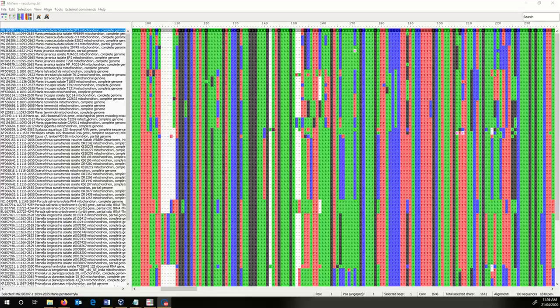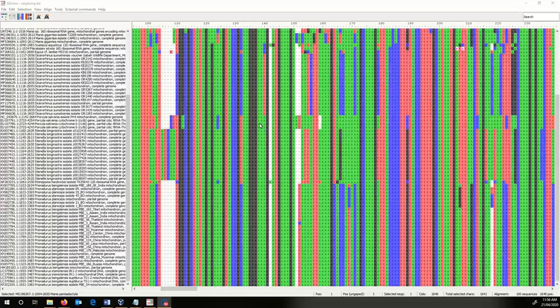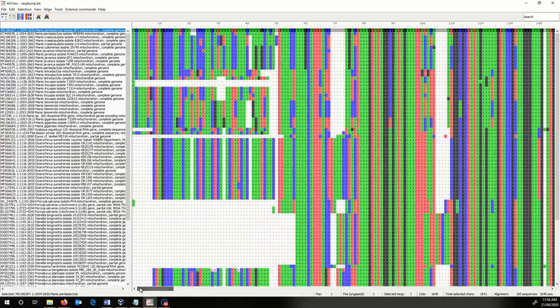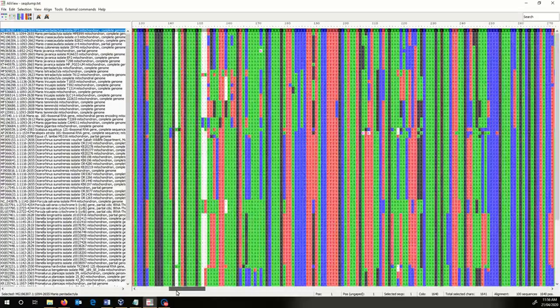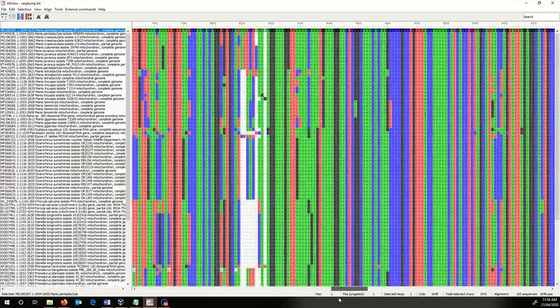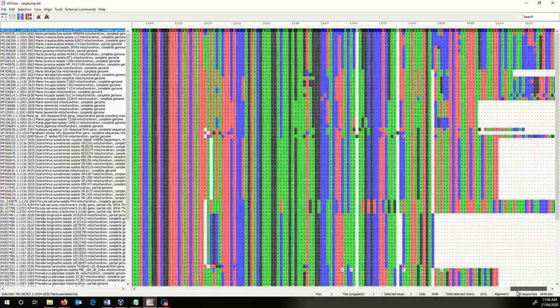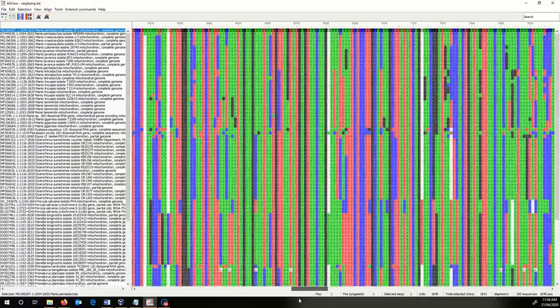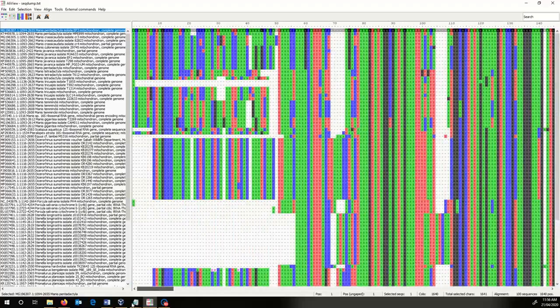What that did was line up all these sequences into what we call a multiple sequence alignment. The names of the sequences are on the left here, all the sequences are on the right. Hopefully you've come across something similar to this in genetics courses and other courses earlier on in your undergraduate phases. And as you can see, there are regions of great similarity among all of them and other regions of variability. This is the sort of stuff we work with to make all this happen.